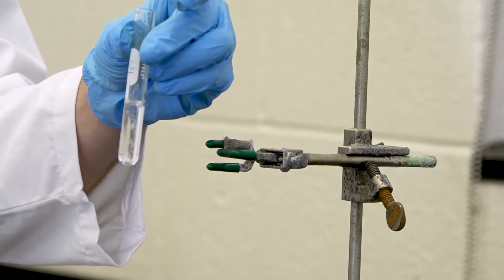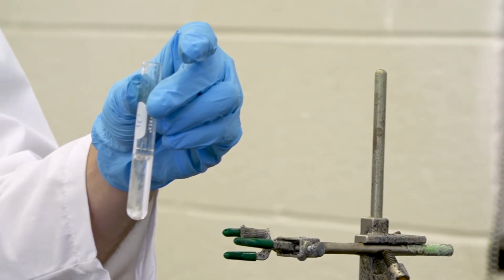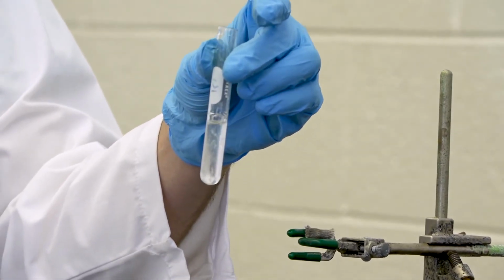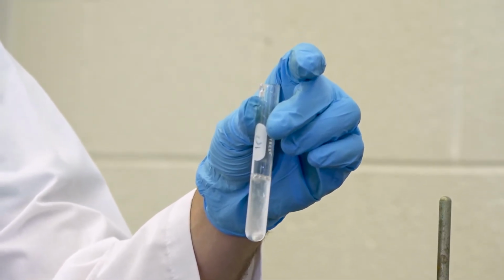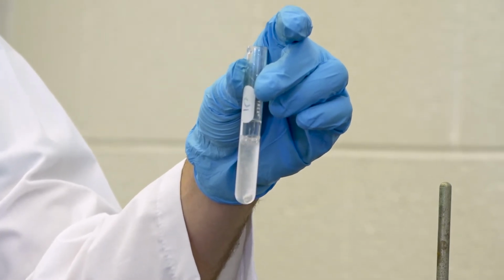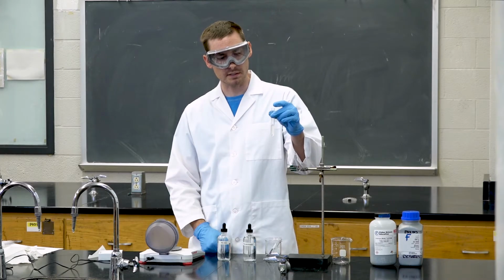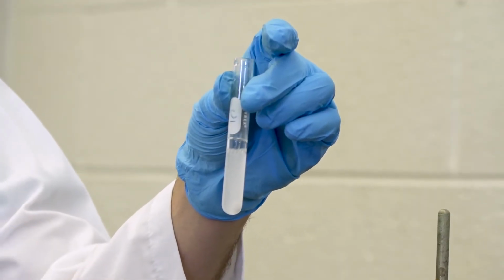So unlike the zinc in water, calcium, with its 2 outer electrons that are easily removed from calcium and donated to the water solution, quickly forms hydrogen gas and calcium hydroxide. So we want to let this go to completion until there are no more bubbles being formed.